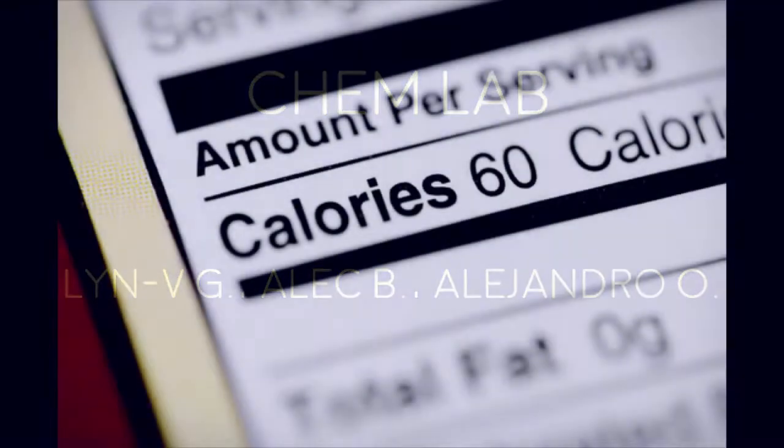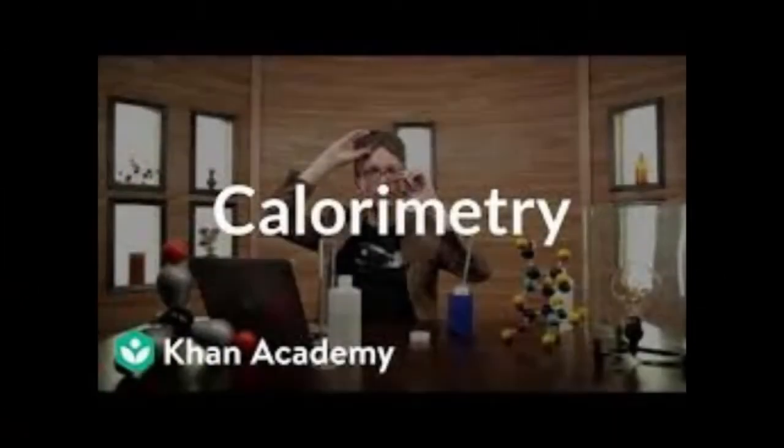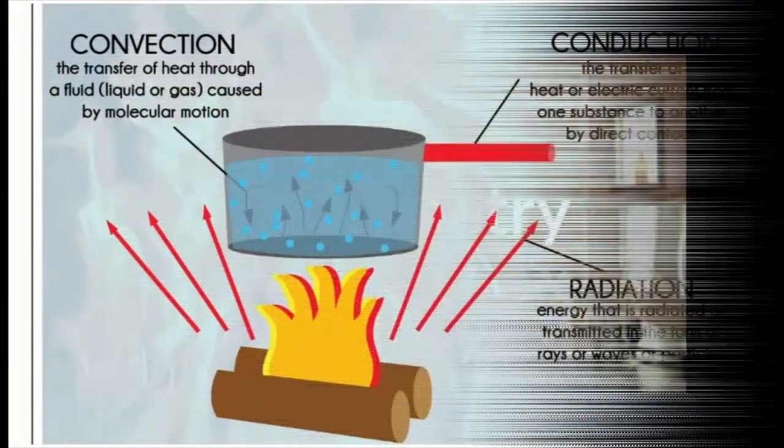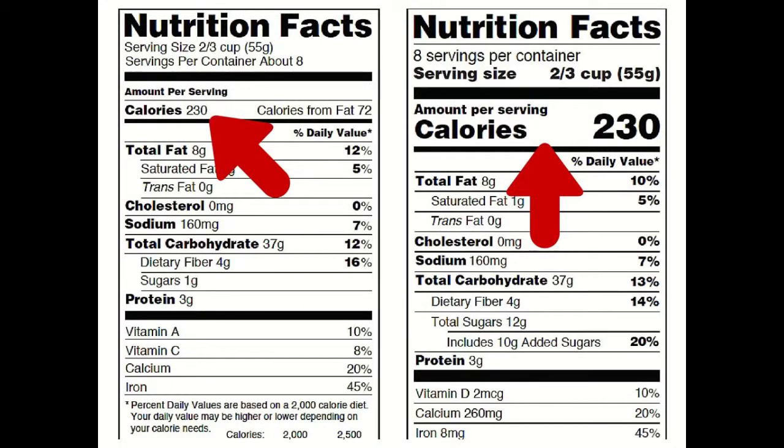The purpose was to determine the amount of energy found in the calorie content of certain foods by using the concept of calorimetry. The calorie content of foods will also be determined by observing the changes of heat in a system. If the calorie content on the label is accurate, then our results will match that of the label.